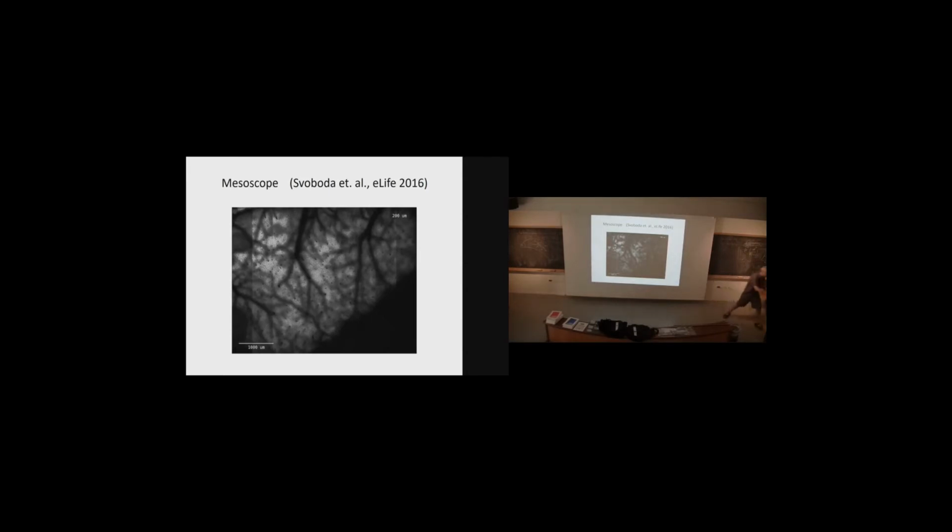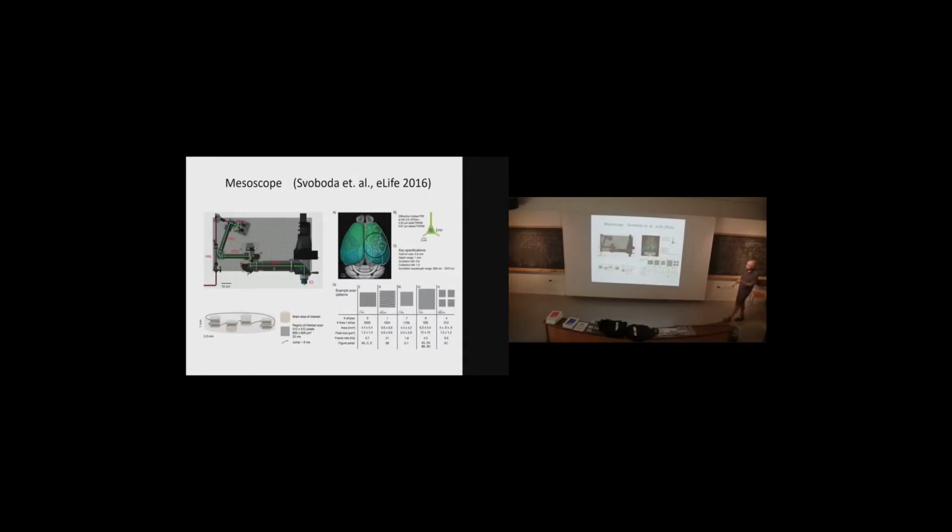No, they didn't move the mouse around. What they did was they sort of bounced. So they have a potentially a large field of view, but what they did was to get the high resolution that they wanted, they looked at small zones at a time, and they just shifted that zone within that larger field of view and then tiled everything together. And the way they shifted the zone is they had another set of galvanometers to shift. They had one fast set of galvanometers to look at small zones at a time, and then they had a slower set to shift the region of interest very quickly.